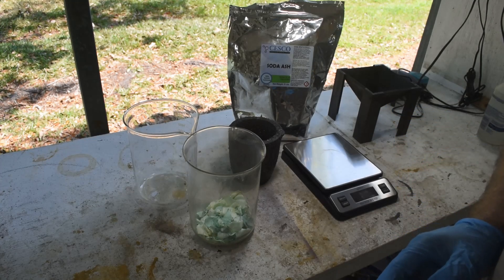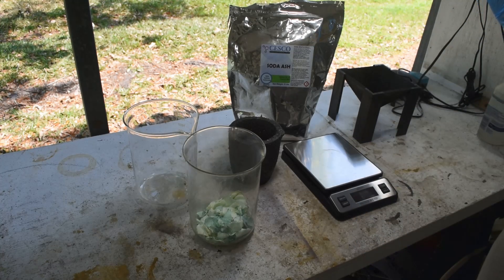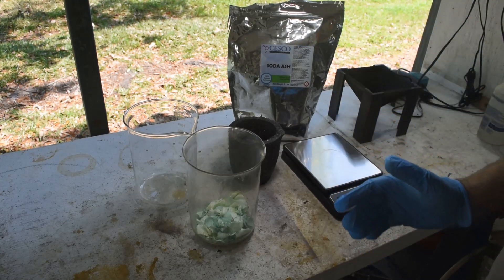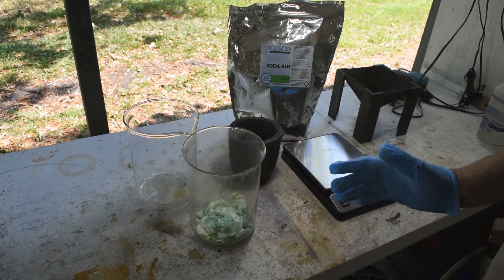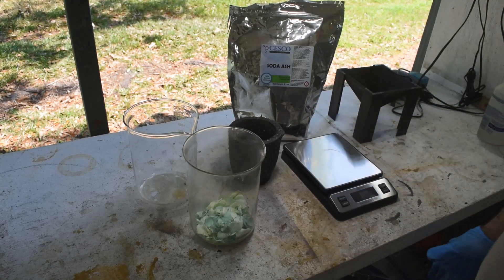Back about four months ago I promised you that I was working on ways to recover tin from my wastes, and a lot of you jumped in with the comments saying yes, please, I need to know how to do that. Tin is too valuable to throw away. My early experiments went great, and then later on I had a lot of trouble repeating them. I couldn't come up with something repeatable.